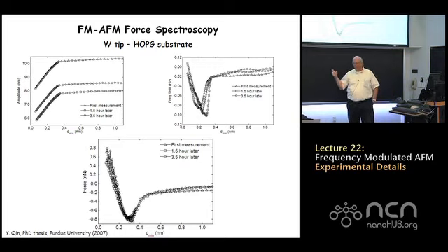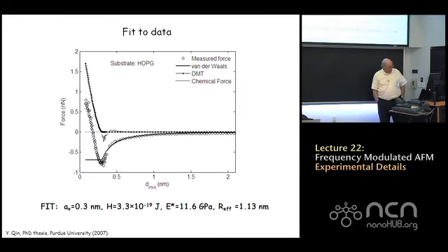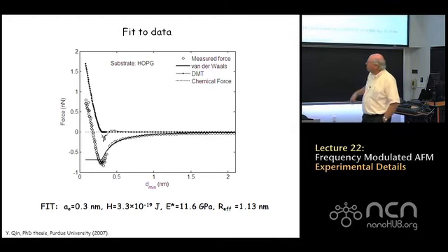So this is a direct measure of this tip-sample force that we've been discussing for over a month. You can try to understand that data by fitting it to the standard models, and I just illustrate the fit that we were able to achieve here. We selected the van der Waals force. For the contact mechanics, we selected the DMT force model. You can see the van der Waals force gives a very good fit to the attractive regime of the tip-sample interaction force.